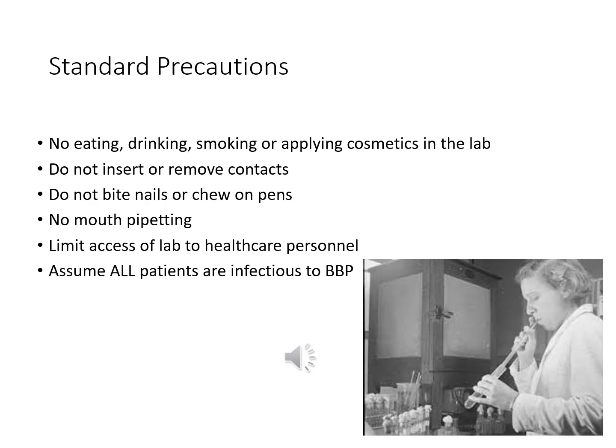For standard precautions in the lab, generally there is no eating, drinking, smoking, or applying cosmetics. Don't insert or remove your contact lenses if you wear them. Don't bite your nails, chew on pens, and no mouth pipetting. Gross, right? There's a picture in the corner that shows someone, before they knew any better, using their mouth for the pipette instead of a bulb. So just don't do that.